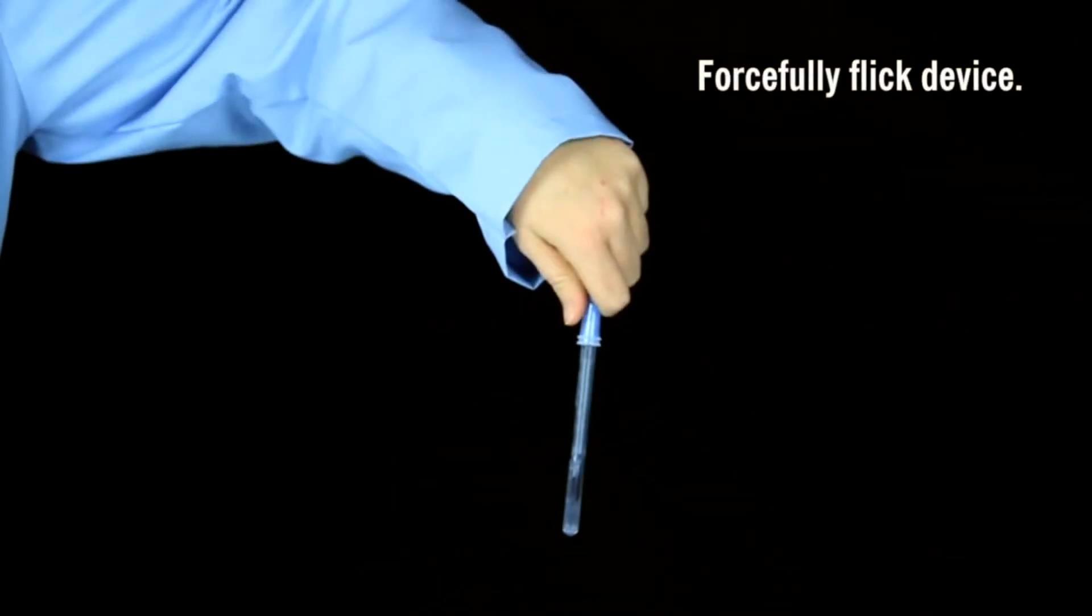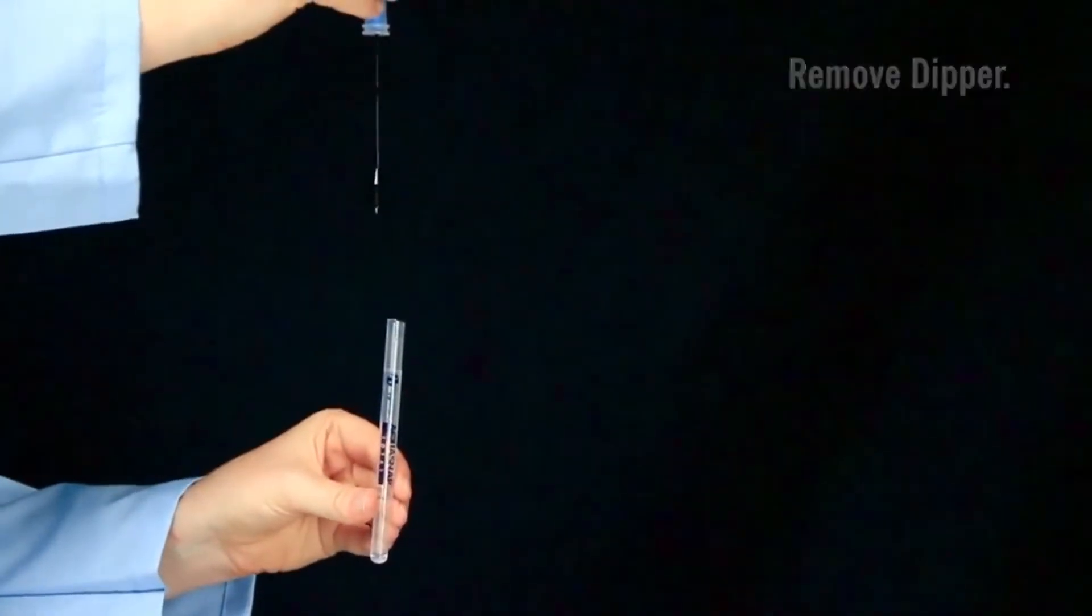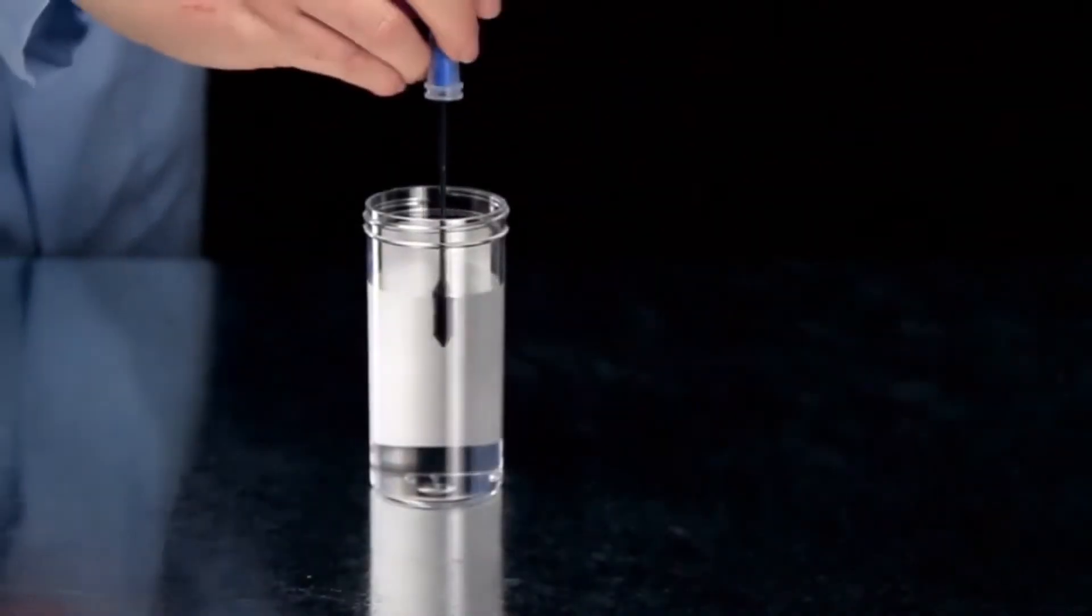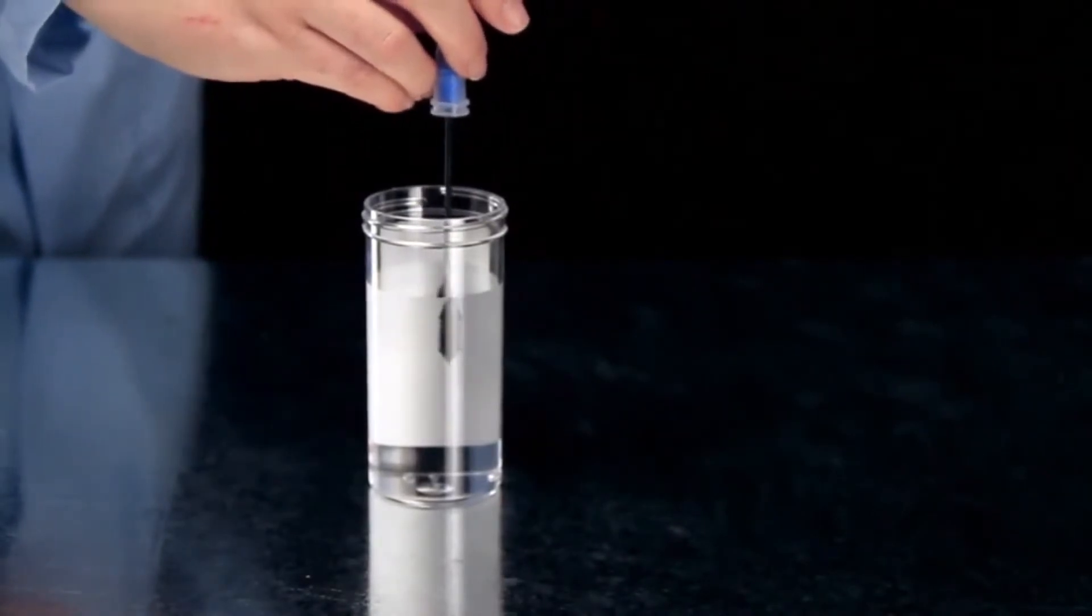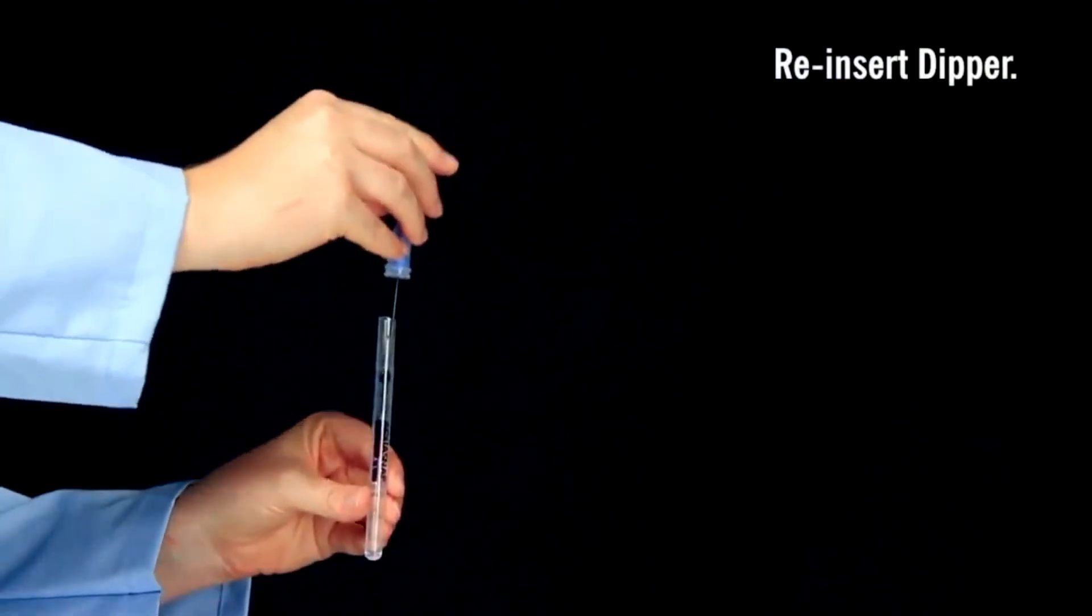Before opening the device, forcefully flick AquaSnap in a downward motion to release the extractant liquid from the dipper tip. You may now remove the dipper from the tube. Submerge the sample collection tip in the water sample for one to two seconds. Do not swirl. Replace the dipper in the tube.